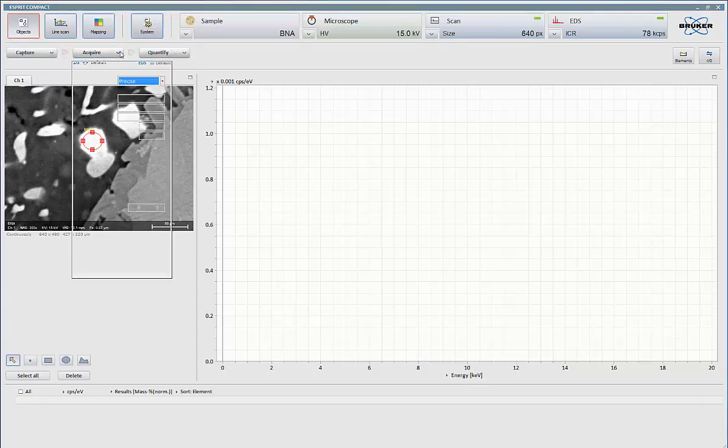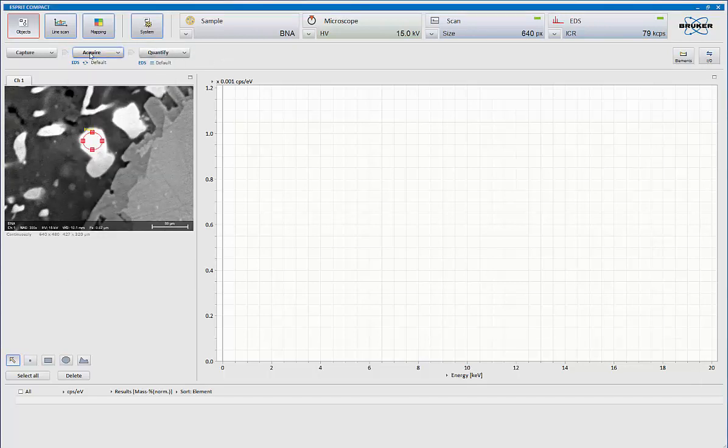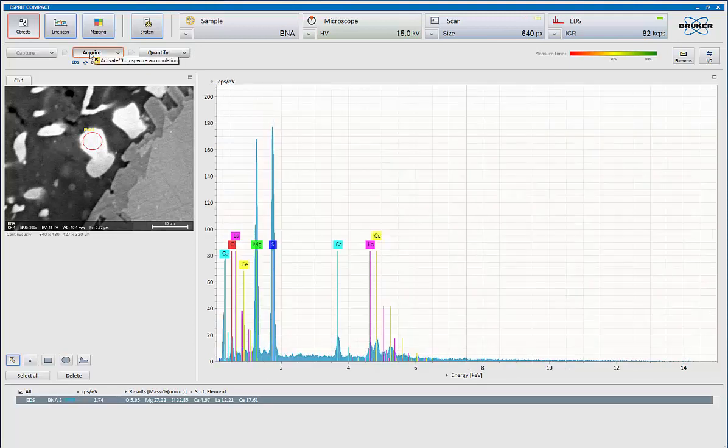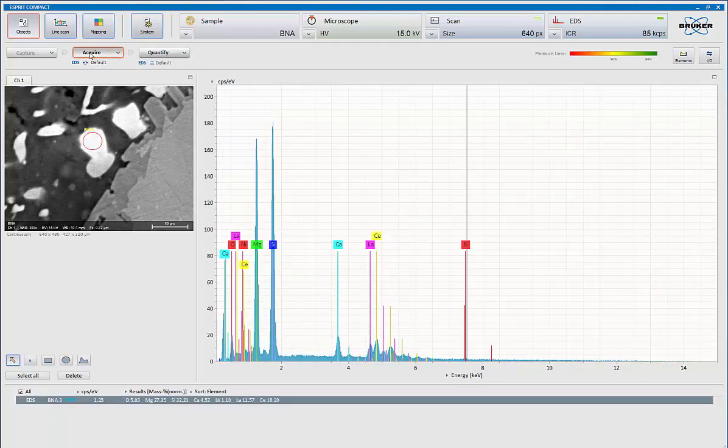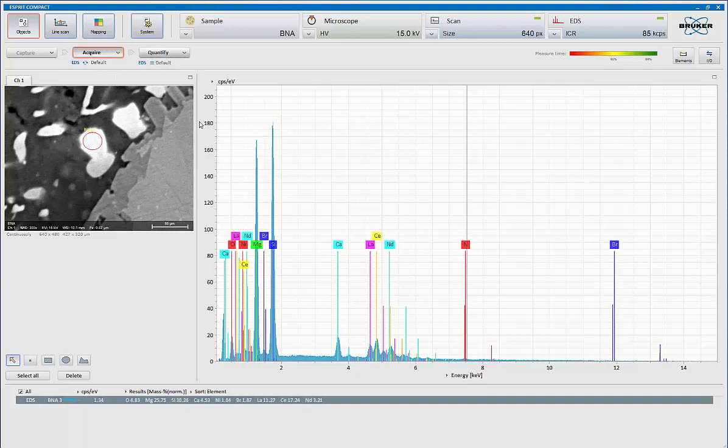So now I'm going to set my acquisition to manual mode for the time being. Hit acquire and here comes my spectrum. Now the system is automatically doing the auto-analysis for me. So it's doing an ID and doing quant as it flies, as it collects data and the statistics improve.